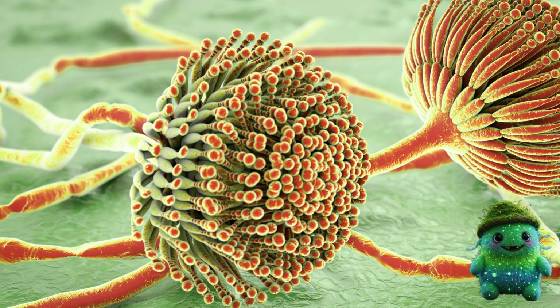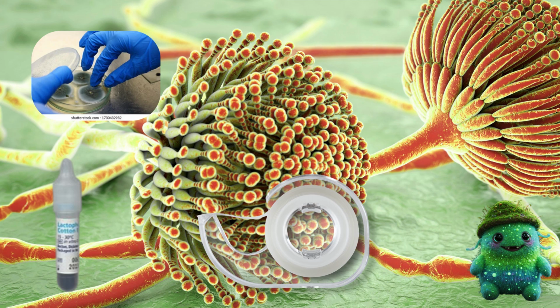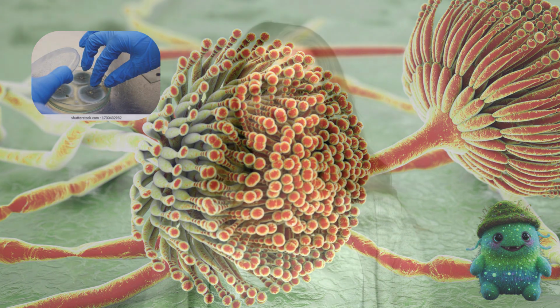The microscopic exam of filamentous fungi, or molds, is usually performed with a lactophenol tape prep exam. This is the most effective technique for examining the reproductive structures that are typically borne on the aerial mycelium at the top of the colony. The cellophane tape attaches easily to structures, such as hyphae and spores, before being transferred to a drop of lactophenol cotton blue on a microscope slide and cover slipped.